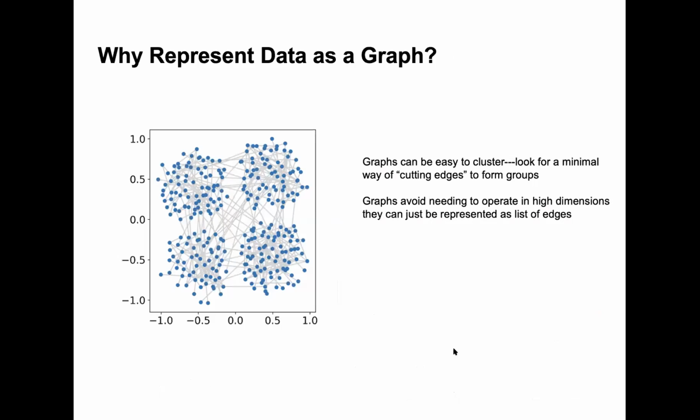So you might ask why. Why is this kind of affinity graph or nearest neighbors graph useful? Using a graph as an intermediate representation can make a lot of the analysis tasks that we're interested in a lot easier. Look at this graph, for example. You can tell pretty easily that there are 4 different modules. First off, because this graph is laid out nicely, and that's visualization. So graph layout can be a type of visualization.